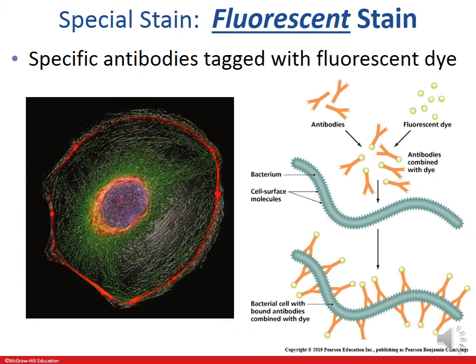Fluorescent stains use both a dye that is fluorescent in nature and that is tagged to an antibody. Antibodies have a very high affinity for the antigens they are matched to. So when they use a fluorescent dye stain technique, you're almost just seeing a halo around the organism, because the antibody takes the shape of and defines the shape around the organism.